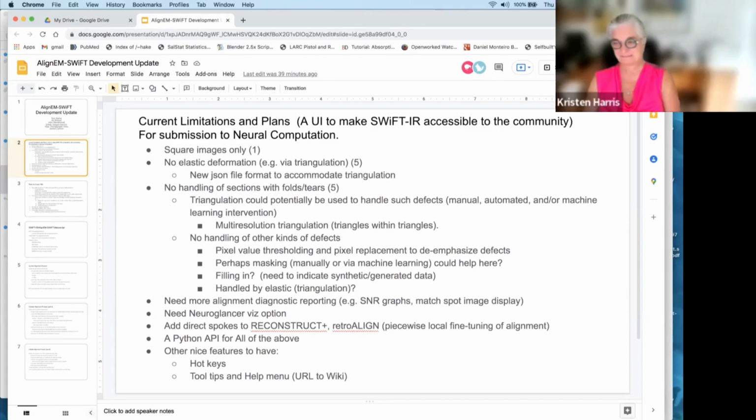And that'll be really great for NeuroNext 2, Art, because we've got scales of images from little itty bitty TEM data sets to Allen brain connectomics style stuff, which they are aligning themselves, but at the same time, future people might choose this environment as opposed to having to brute force it the way they did.